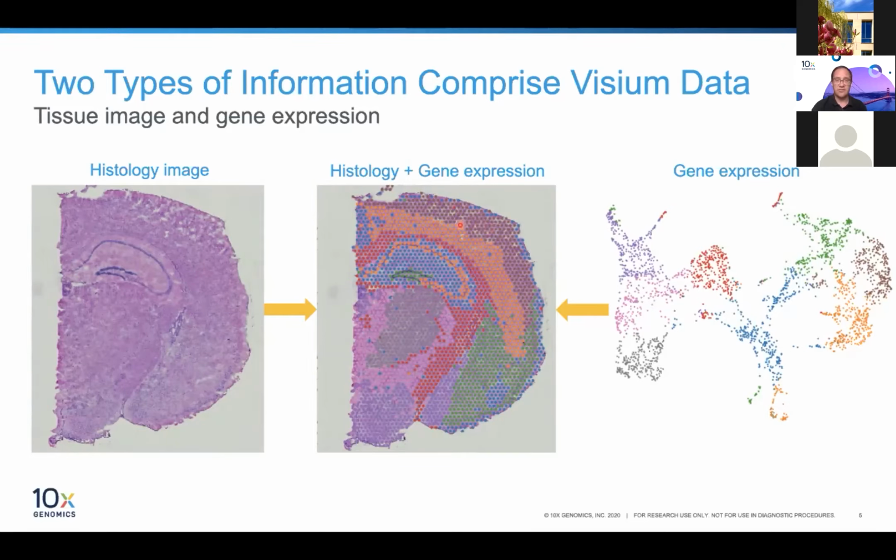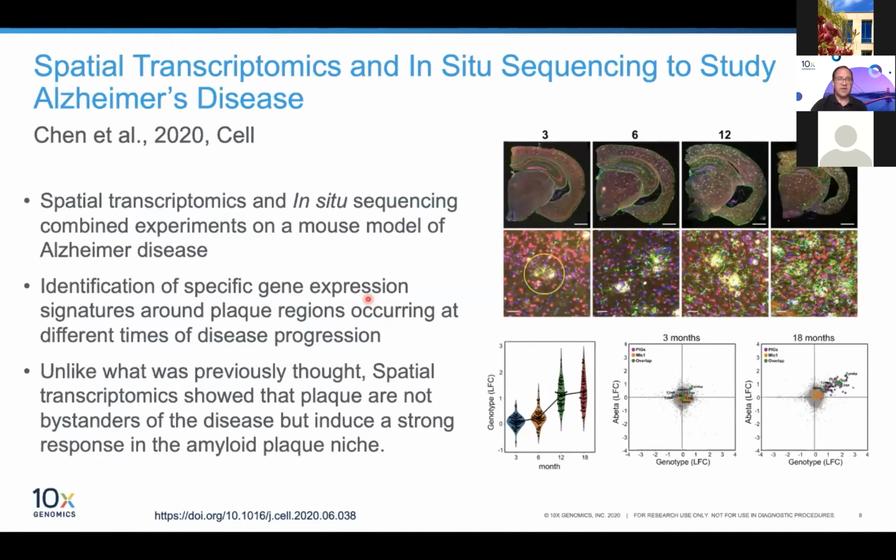So it's quite a powerful technique to cover a broad area of tissue and get the resolution down to hundreds or even thousands of genes when we do these kinds of approaches. In terms of some of the basic papers, I should have probably checked this before we started, but I think there are about 80 or so publications right now with Visium, and I often use this one because it's quite an easy explanation of what people are doing.